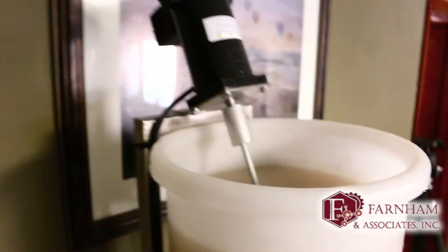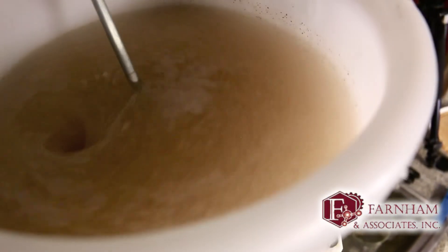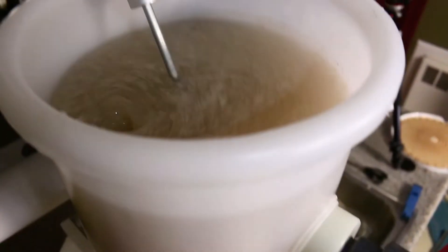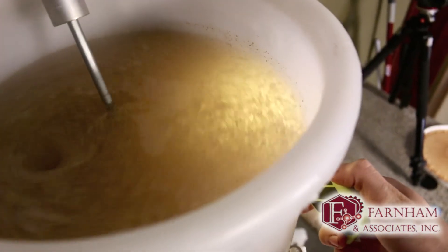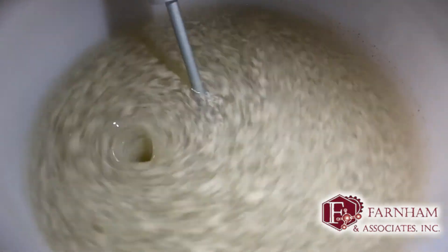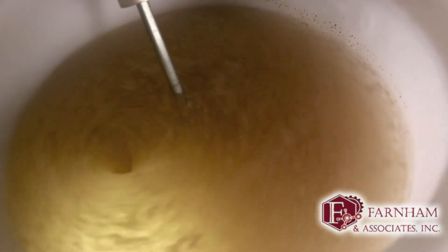Up to about 2.8. And there you go — you can see it's already starting to floc, particles are dropping out real nice. Very impressive — no pH adjustment, it pretty much does it itself.